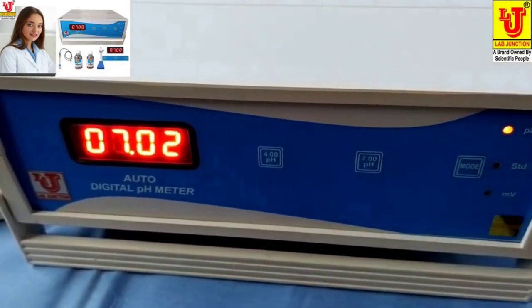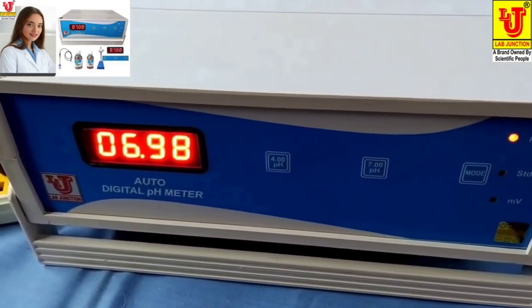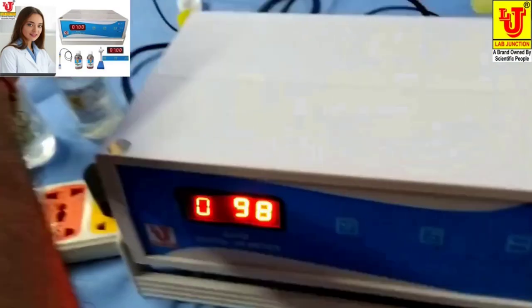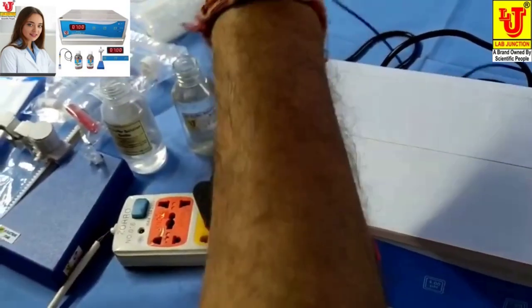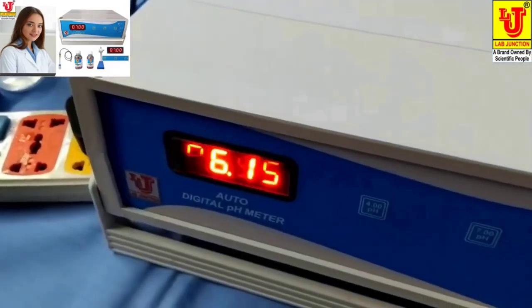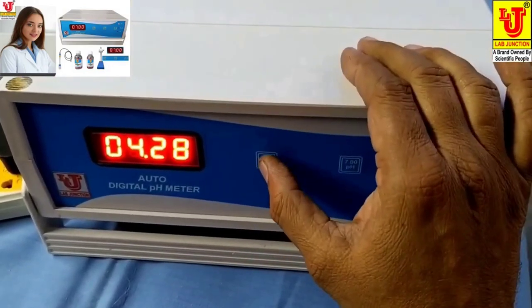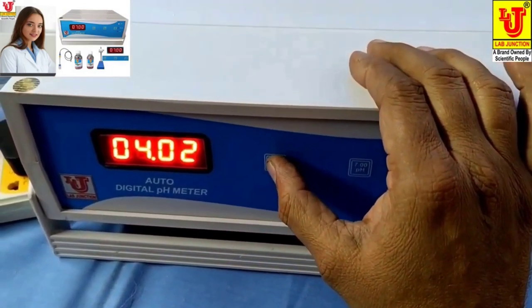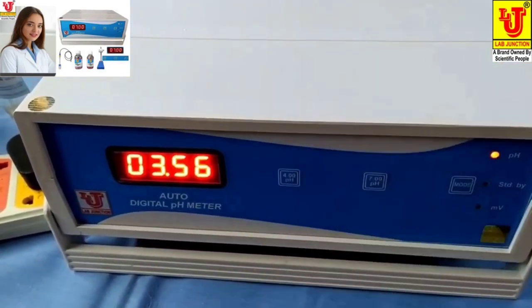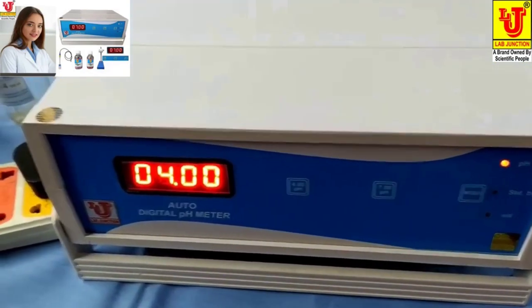Set to pH 7. Now remove the pH electrode and dip it in pH 4 buffer solution. Press the pH 4 button. You can now put it in pH 4.